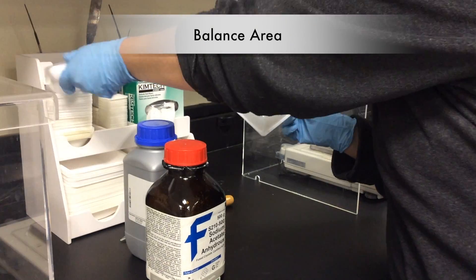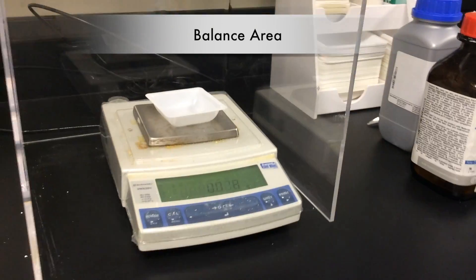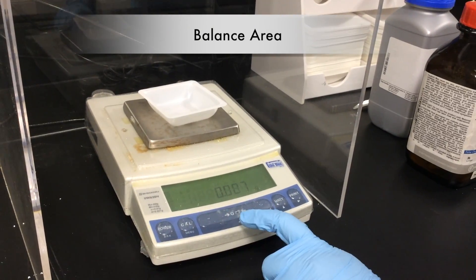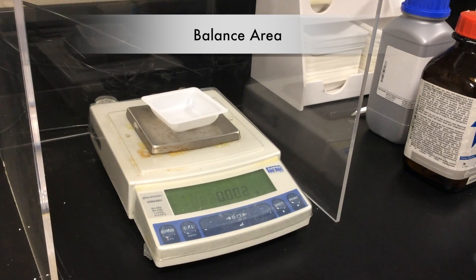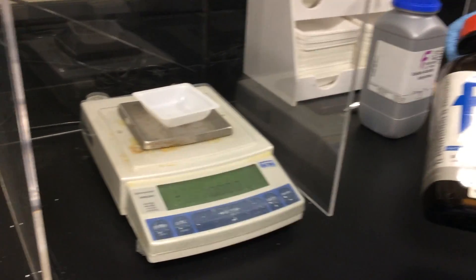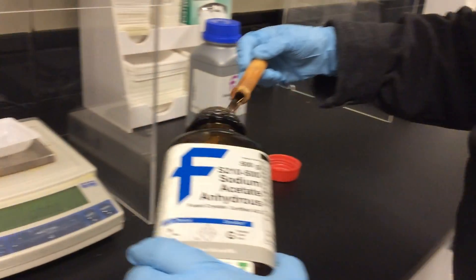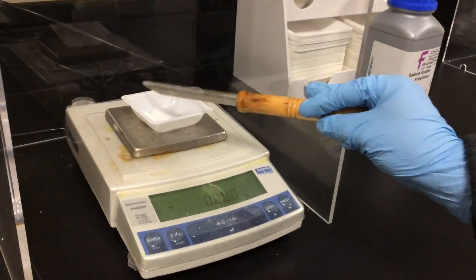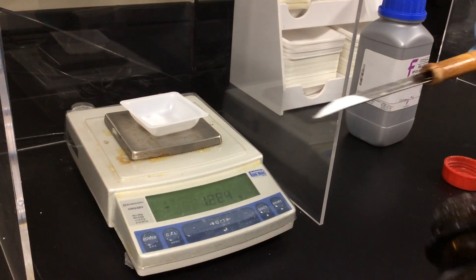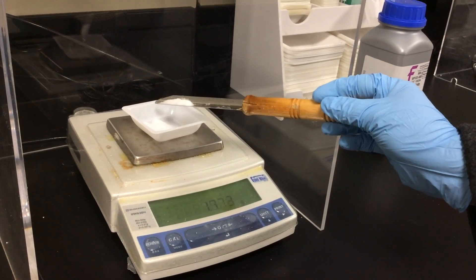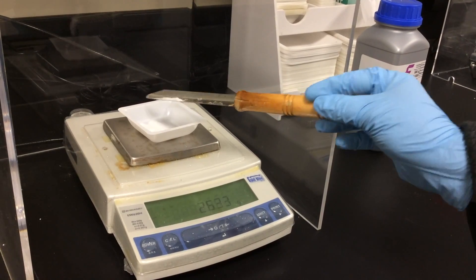Now we're going to start getting our chemicals for mixture B. We're coming over to the balance area, taring the balance. Once it's zeroed, we will add 2.4 grams of anhydrous sodium acetate. As you put sodium acetate into your weighing boat, you want to weigh out as closely to 2.4 grams as possible.